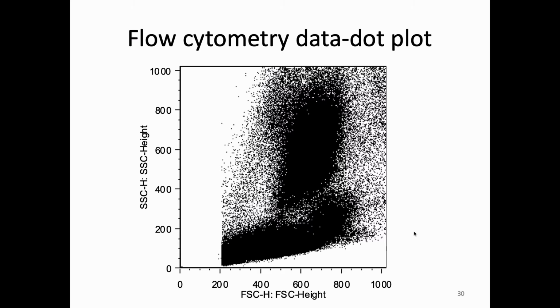So oftentimes, when you think about flow cytometry, you end up with data that looks something like this. This is a flow cytometry dot plot. You will see that I have 2 axes with a whole bunch of dots. Each dot is a cell. And we are actually looking at one of the parameters, the number that the cell got, on one of those 6 parameters, either forward scatter, side scatter, or one of the 4 colors, versus one of the other ones. With the software, you can pick which 2 you want to look at against each other. So here we have forward scatter versus side scatter. You can also see the number of cells that we're looking at here.